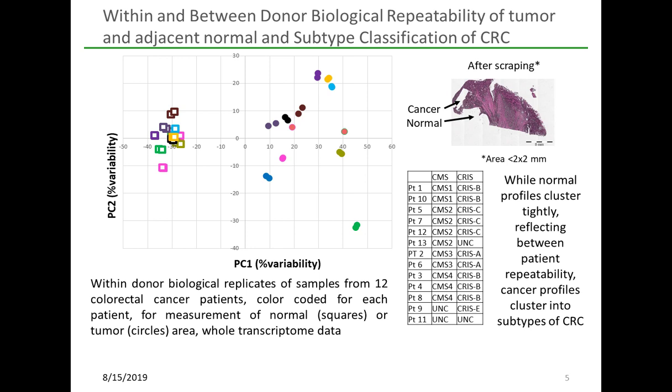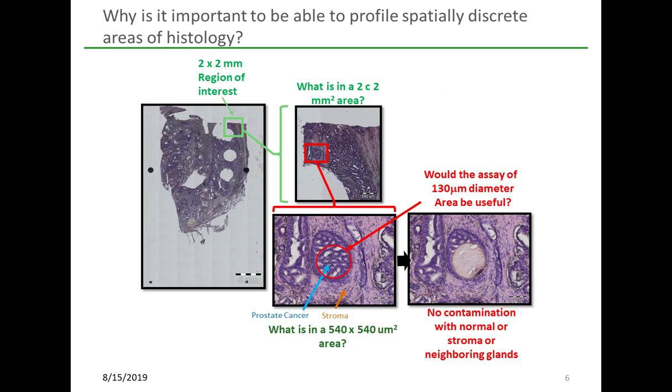And we have one patient that we could not assign, and one patient that we could only assign to CMS, but there was no adjustment made for differences between the Tempo-Seq platform algorithms that you might want to optimize to versus the microarray. So you definitely can get very useful information off of bulk samples.